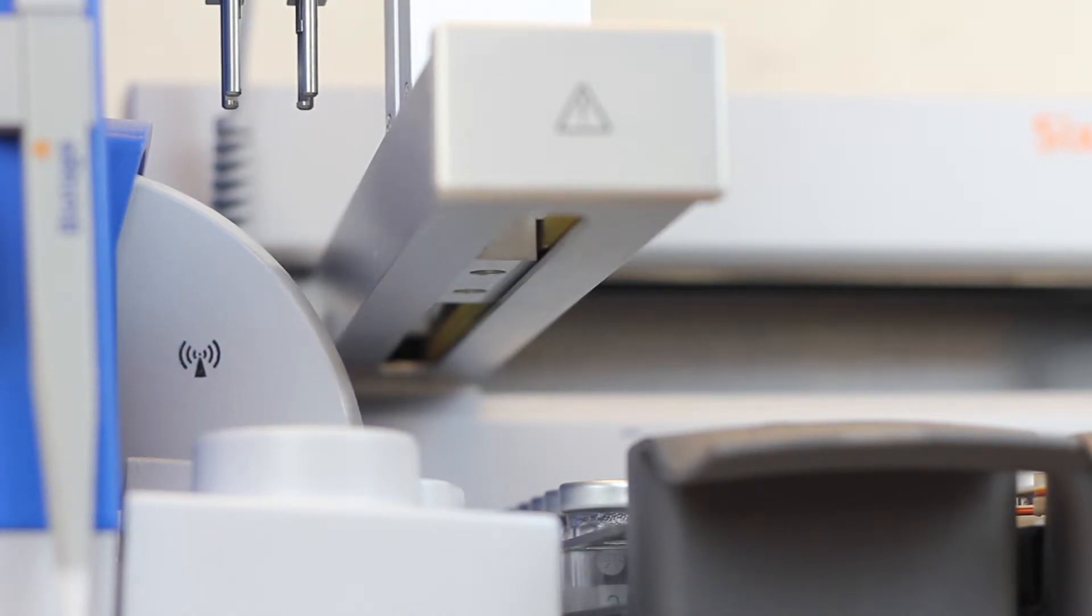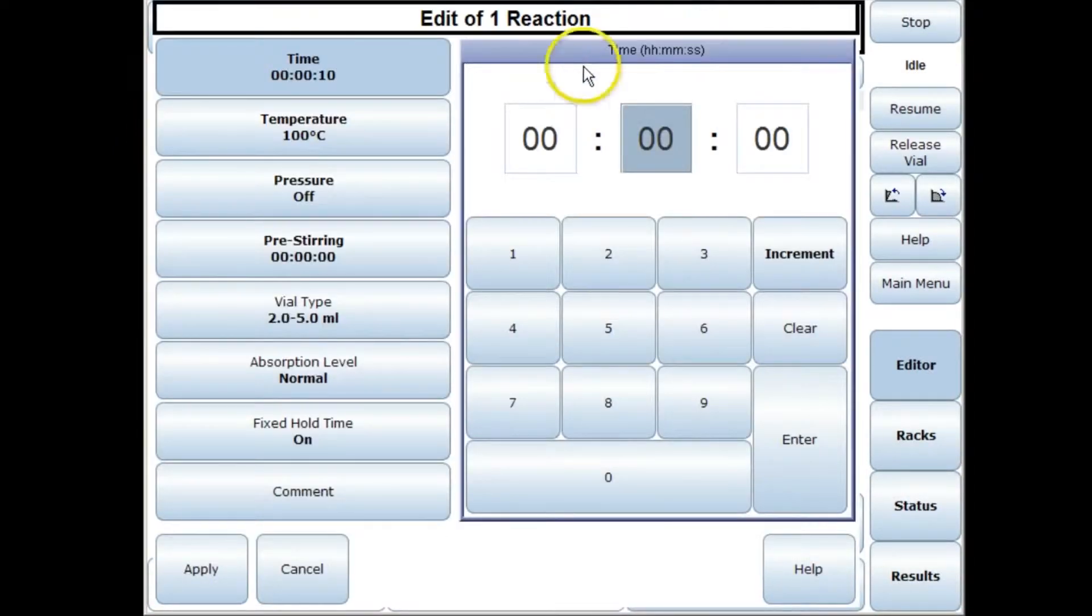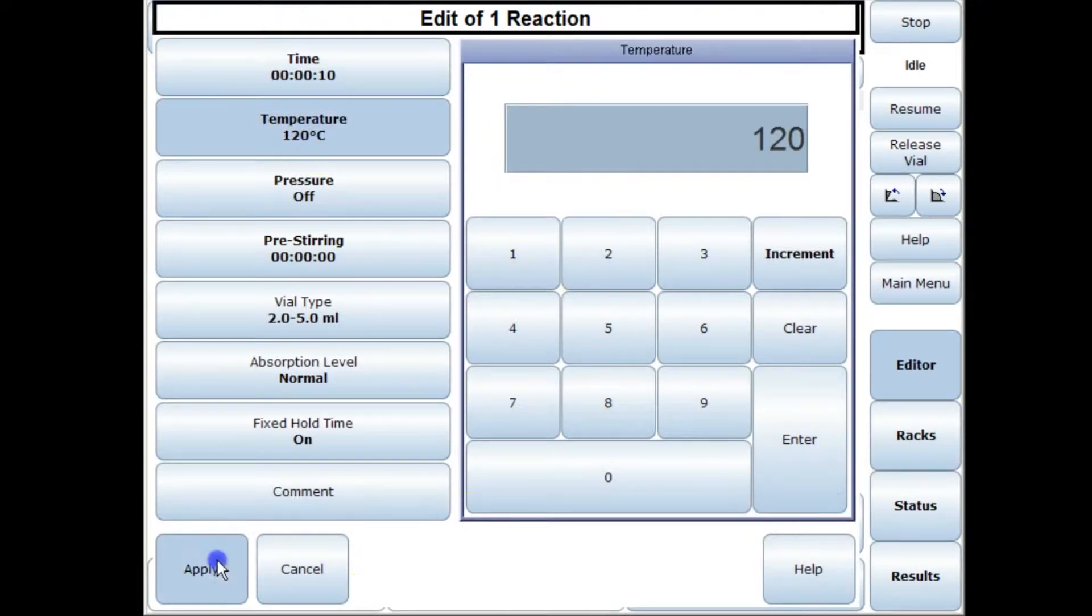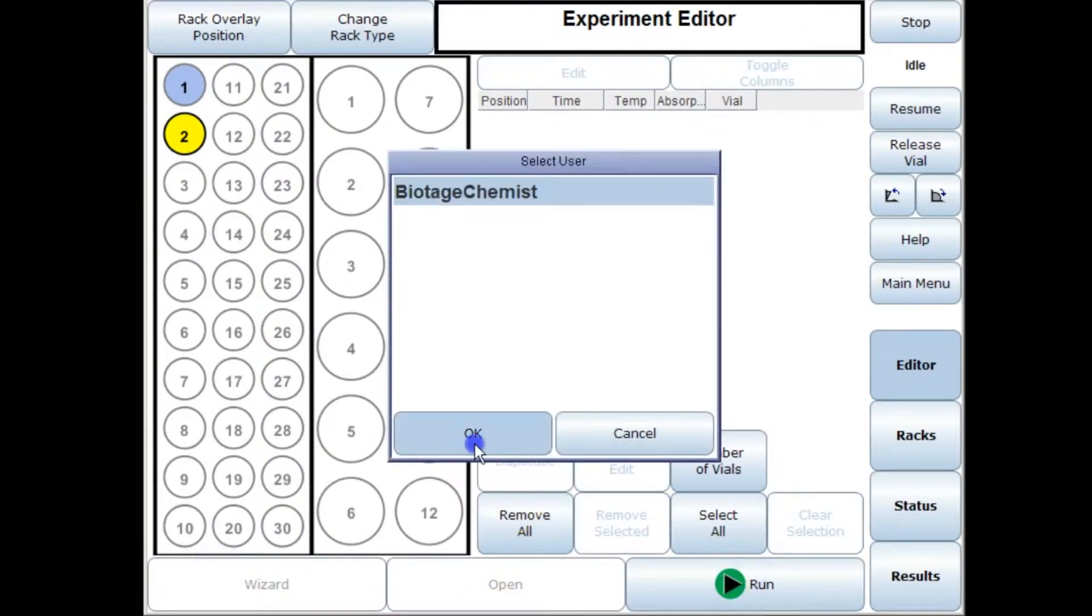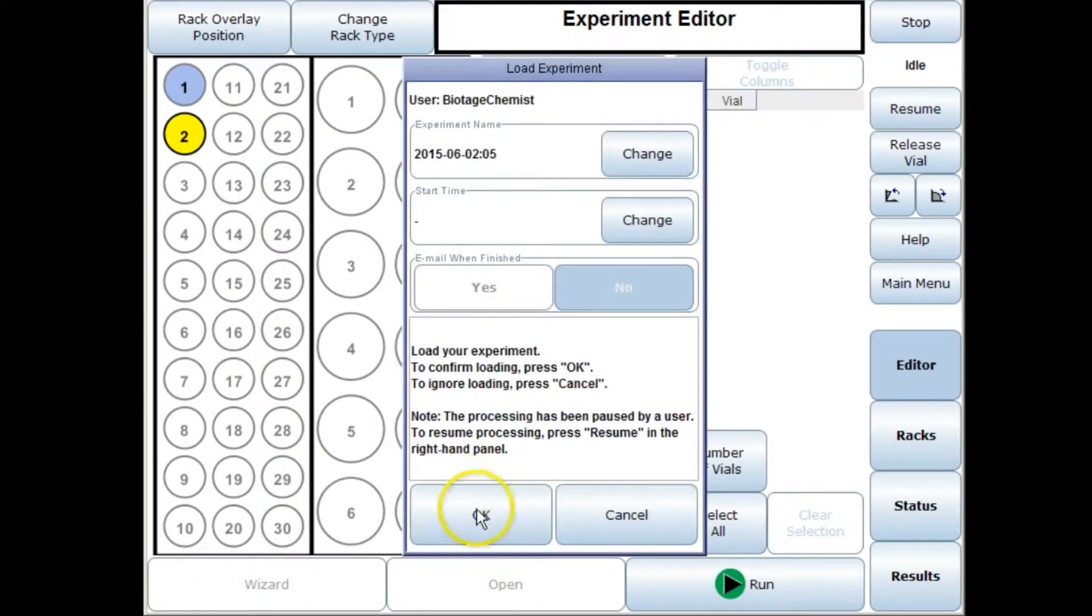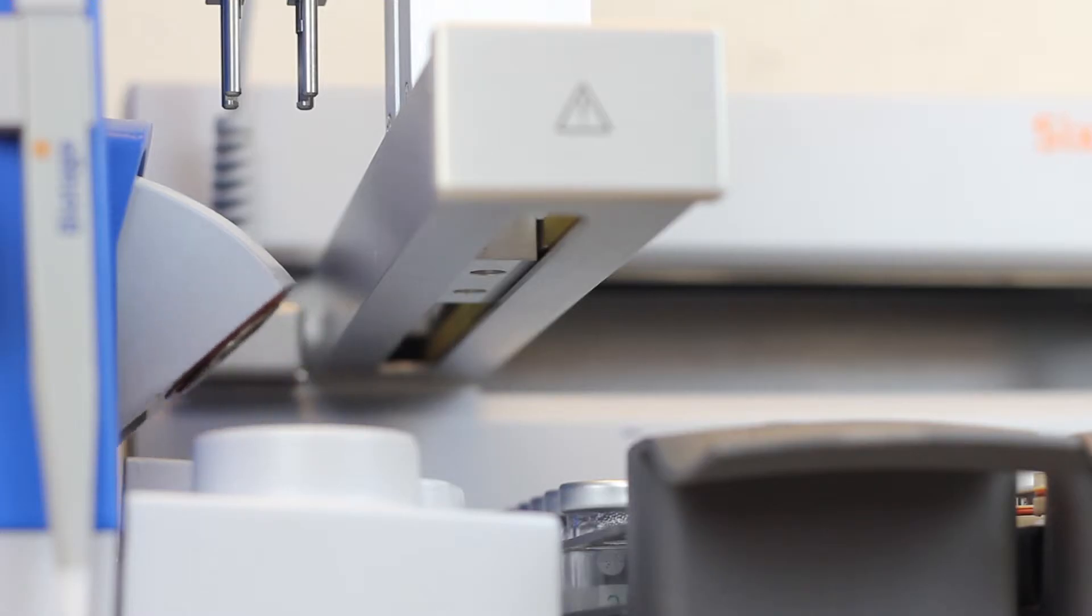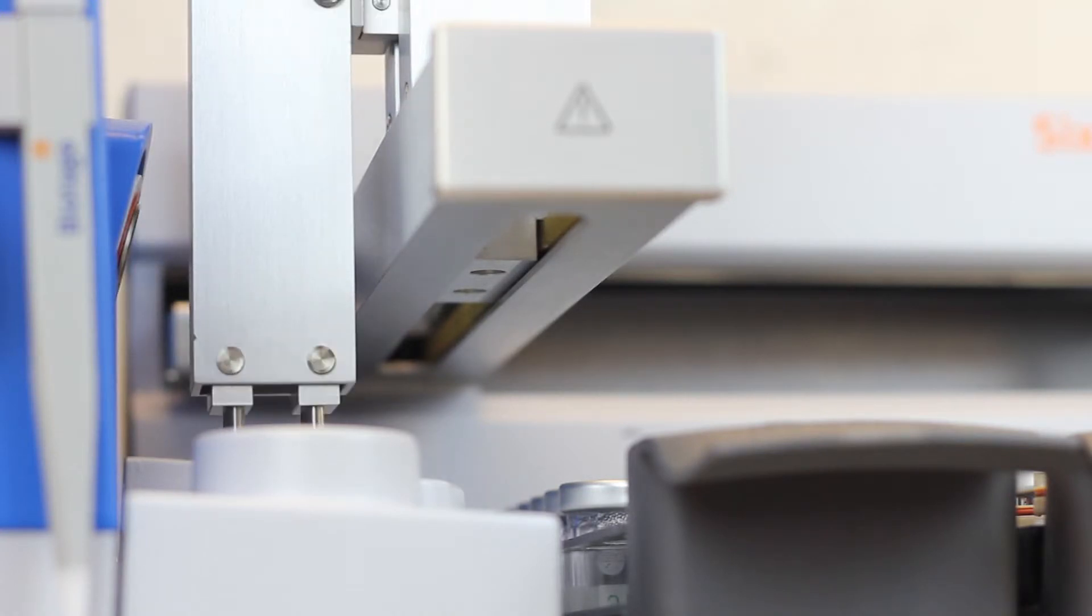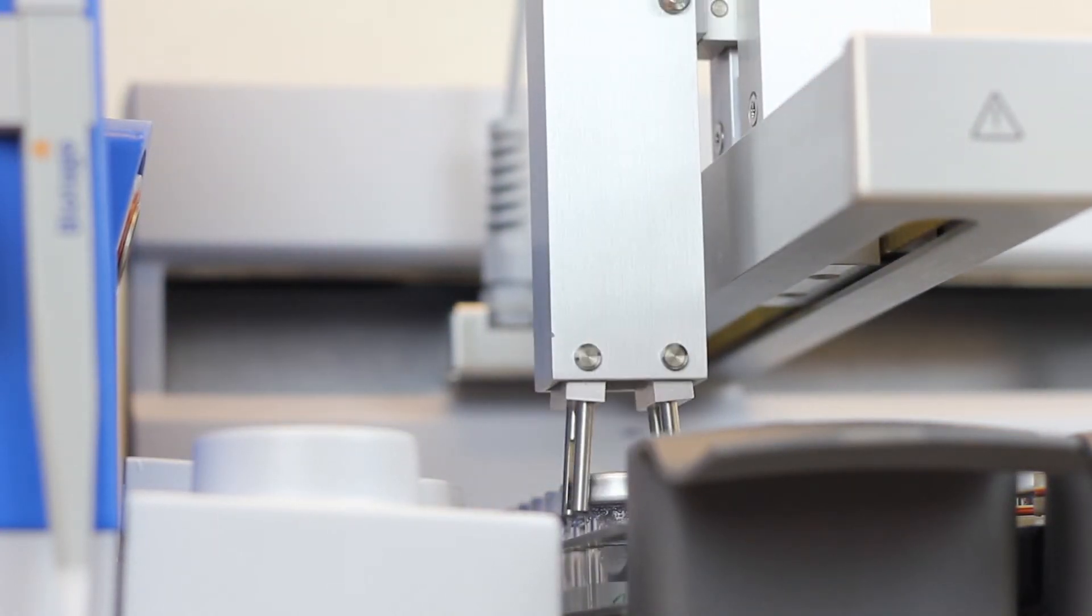Somebody else in my lab can come up and they can set up a reaction as well. They can set up their own parameters, apply that, press run and that will be queued up. This means that you don't have to wait for one person to finish using the system before somebody else can use it.